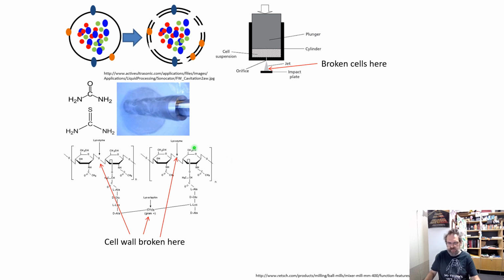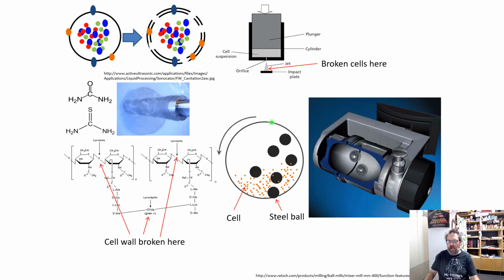What we find is that rather than using things like lysozyme, snap freezing cells and lyophilizing them to a powder, where you remove all of the water out of the sample, is a much better way of doing this, because you can then put them in a ball mill and grind them to talcum powder. Because there's no water, these things become very brittle, and you can grind them down to very, very fine particles. Therefore you've got smaller pieces for the chaotropes and the surfactants to interact with and go inside to solubilize the proteins back out of them.